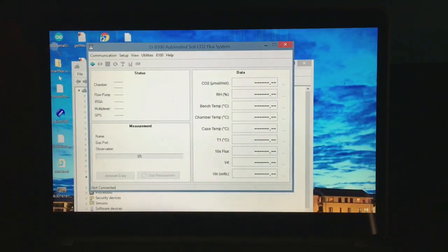and you can connect to the device from the software through multiple ways, either through the network or through the serial port. You can refer to other videos on the website or to the instruction manual on the different connectivity options. Here I am going to do the RS-232 connection. For this, the first step is to figure out what is the actual serial port on which the instrument is connected. So we are using an RS-232 to USB adapter to do this connection, and we have to confirm that port through the device manager.